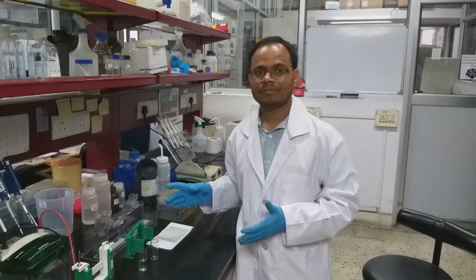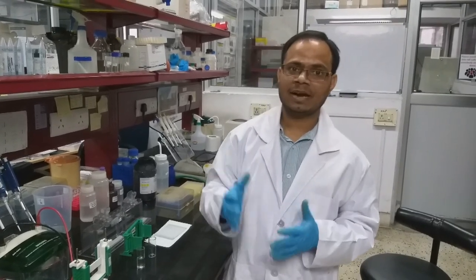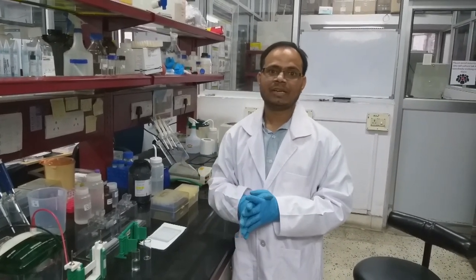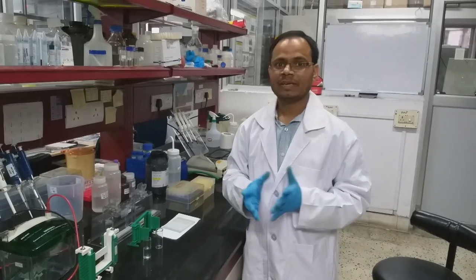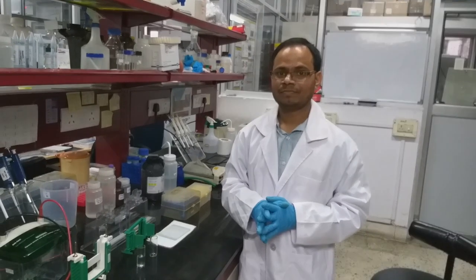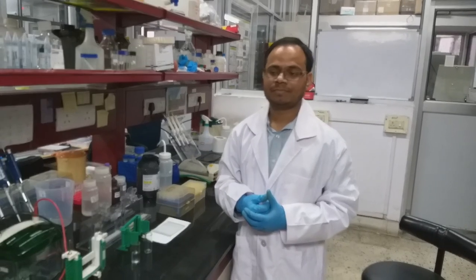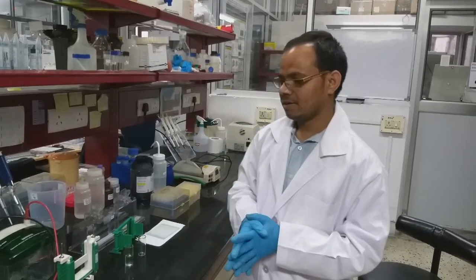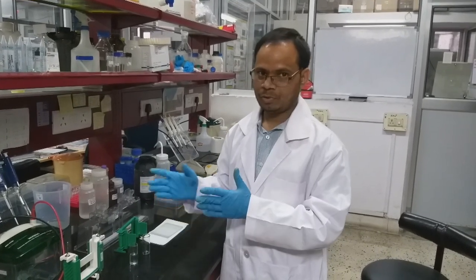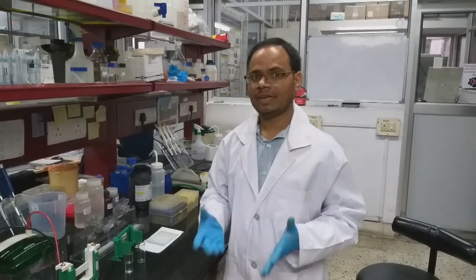After solidifying, we have to prepare the stacking gel. The stacking gel composition is the same, but it is diluted. It contains pH 6.8 Tris HCl and the remaining components are the same, but in lesser quantities. After preparing the gel, we will load the marker and the protein, which is denatured at 100 degrees Celsius for 3 minutes.